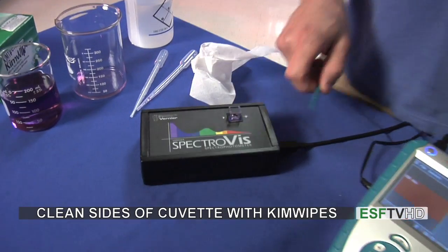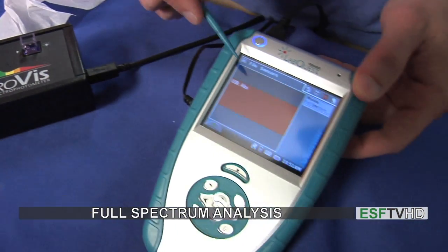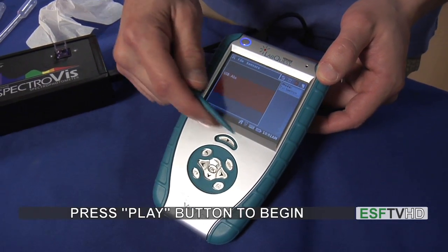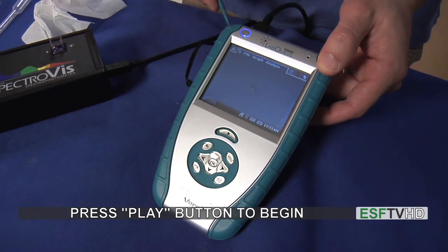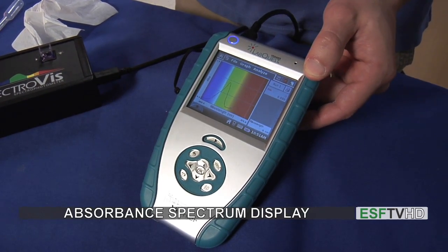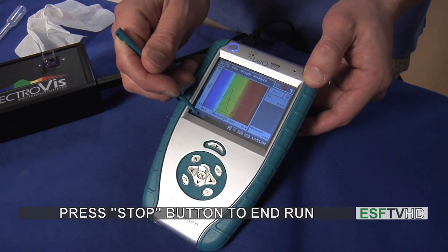This is going to require a full spectrum analysis of the solution. I can see here that it says full spectrum, and I'm going to hit the play button. When I hit the play button, it'll switch to the graph screen and I'll get a very nice absorbance spectrum of my solution. When I'm satisfied with that, I'll then hit the stop button.